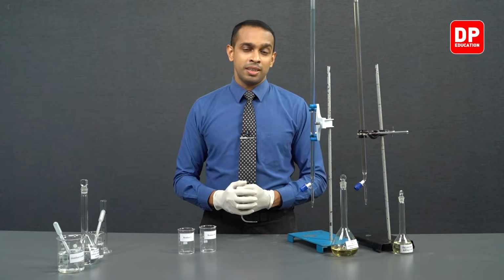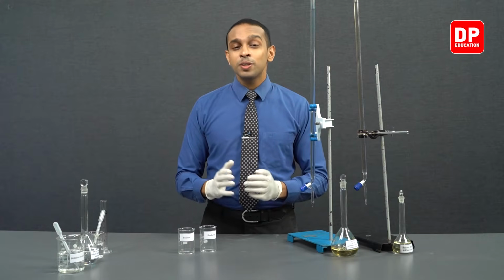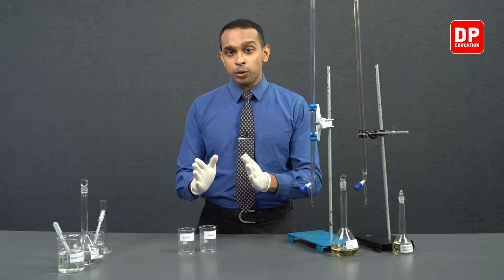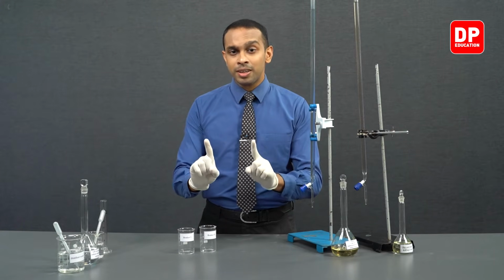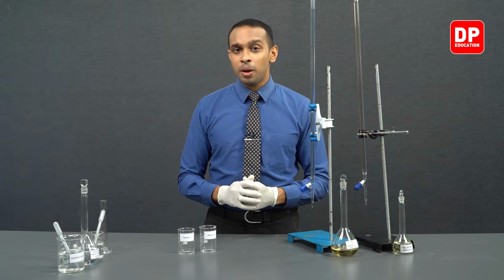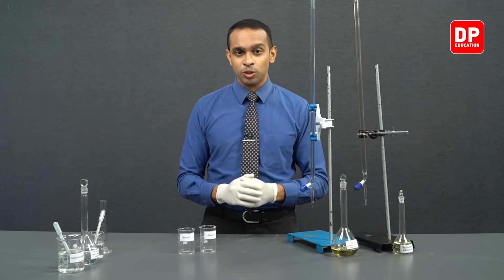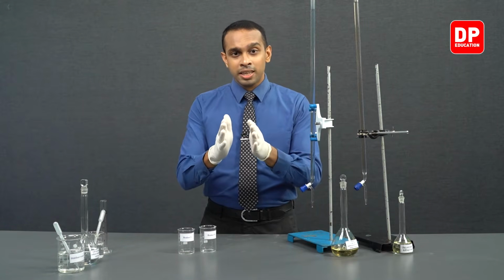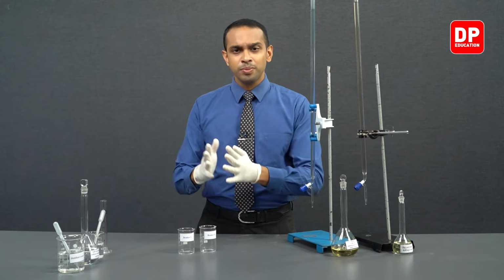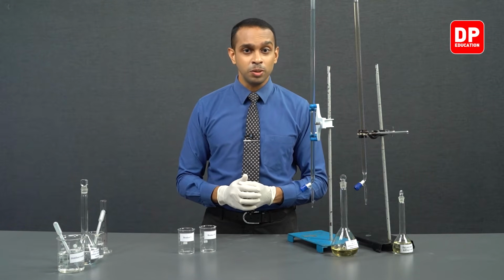In this particular reaction, iodine is produced. So we can use the time taken for a certain specific amount of iodine to be produced. That is going to be the measure that we are going to use to measure the rate of the reaction. So we are going to observe how long it takes for the reaction to produce a certain amount of iodine. So how can you know when a certain amount of iodine is produced?